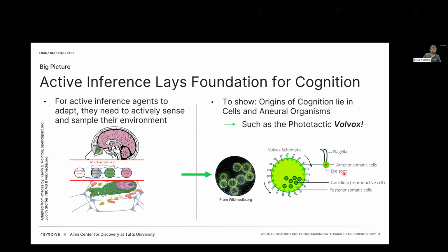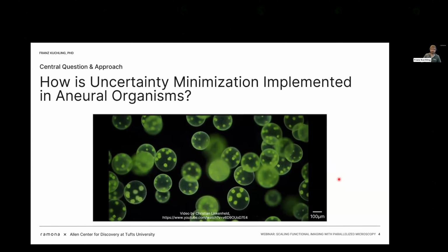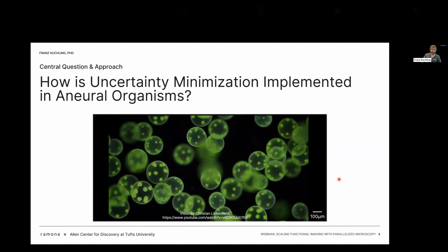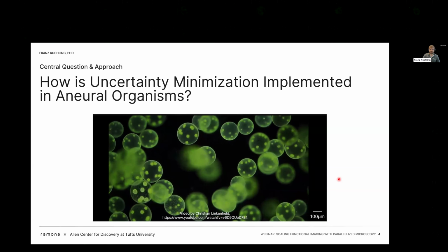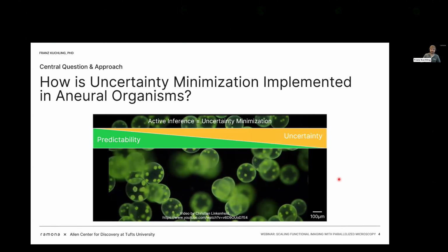The reason I picked that organism is because it has a very measurable response to an external input, light, and it's just big enough to pick out with low resolution microscopy. And so this is how they move in real life. You can see now where they get their name Volvox from, the Latin word volvere. They revolve around, which is actually part of its adaptive capability to desensitize and resensitize to light by always exposing a different part of its sphere.